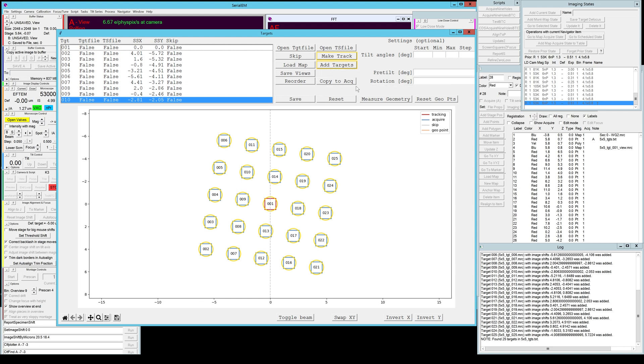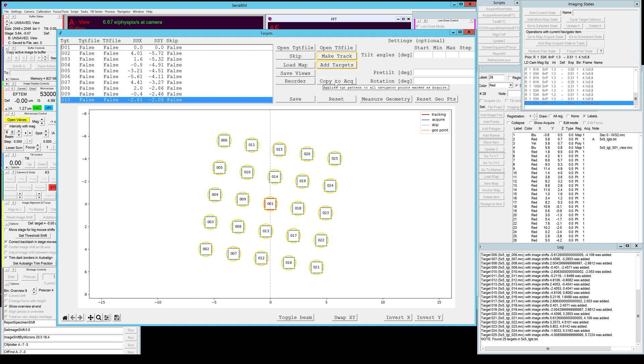One option was not available with the other types of target selection is this copy to acquire. This allows you to copy this target pattern to different stage positions. Unfortunately we cannot do it quite yet because what it will do is copy this pattern to every point in the navigator that already has the acquire mark but no targets file associated with it.